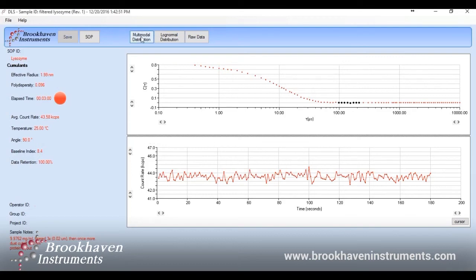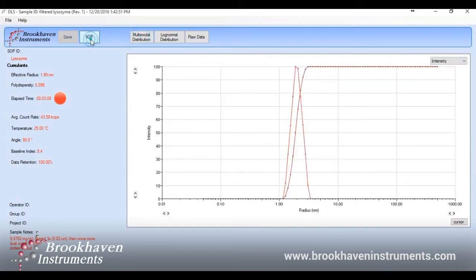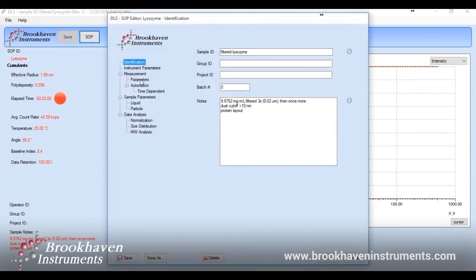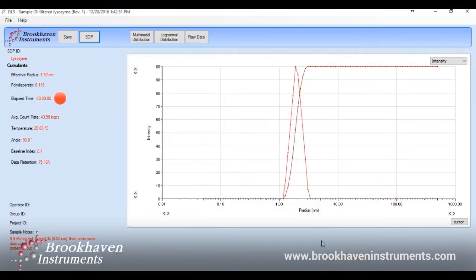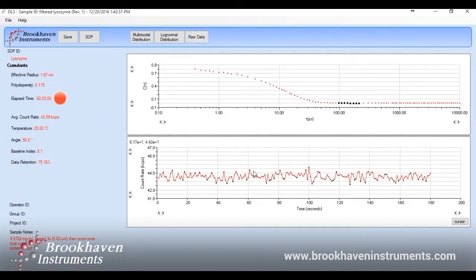If the dust filter is turned on in this case, it takes out a few more fluctuations that may be due to stray dust and helps create the perfect measurement. A radius of 1.97 nanometers is measured with a data retention rate of 75.16%. This radius is much smaller than what was measured before physically filtering the sample. There also is a much smaller difference in the size when the filter is on versus when it is off.